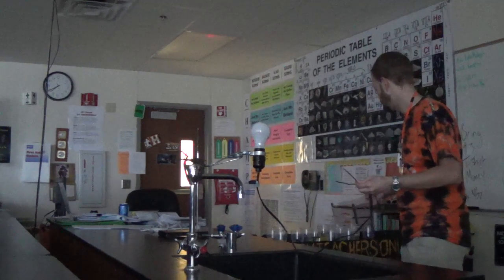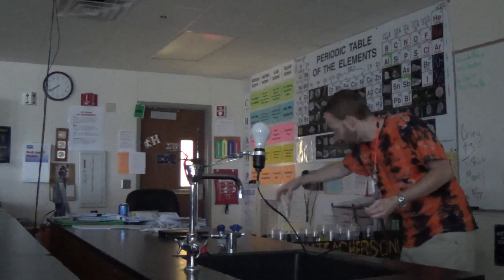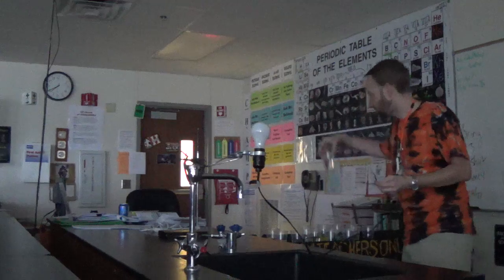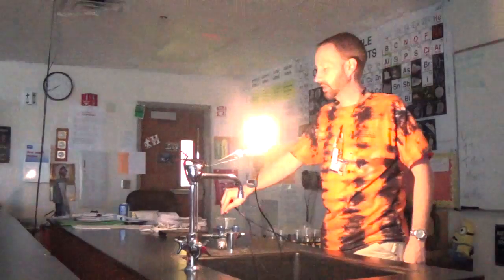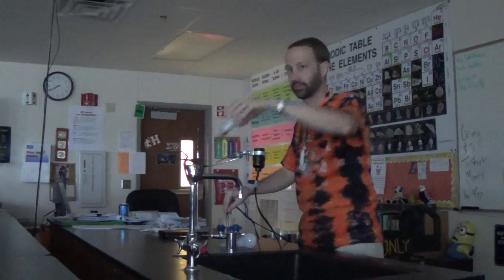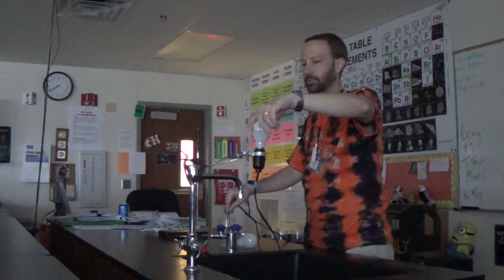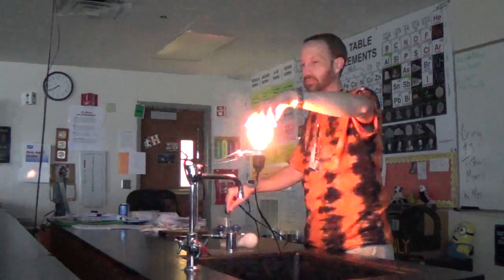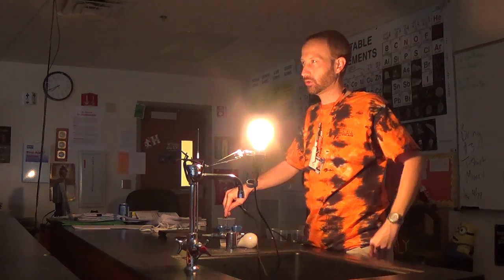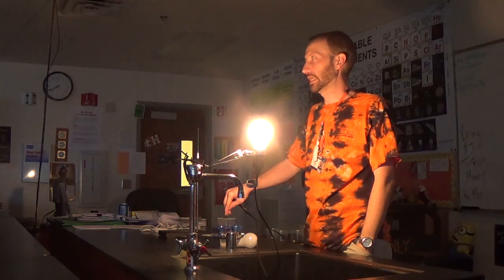Well, what about the next one? Sodium chloride in distilled water. What's the difference this time? It's dissolved. Yes, dissolved. The 34 watt bulb works really well. Let's try the 100 too, in case it's just weak. It does work. Salts make for some very good electrolytes.